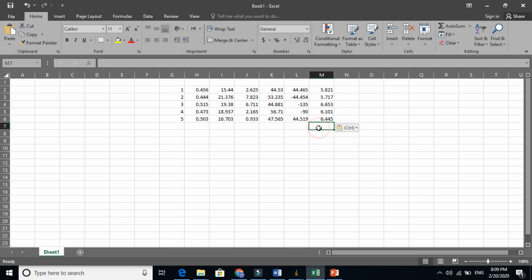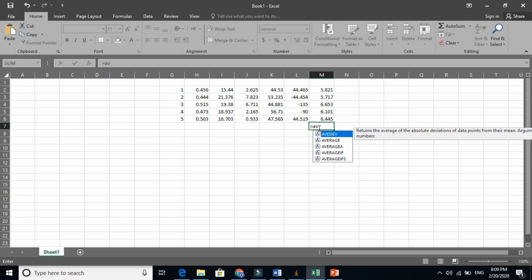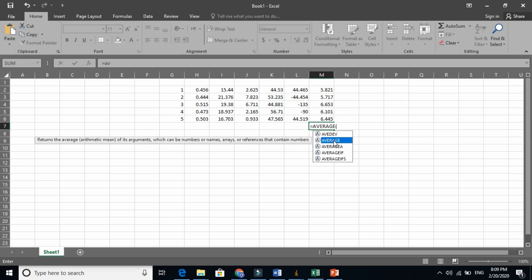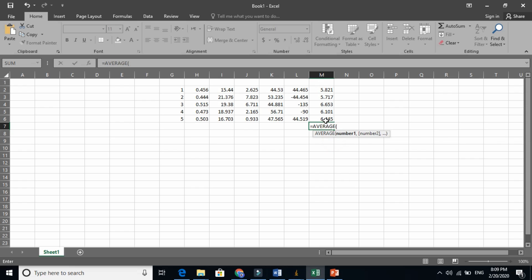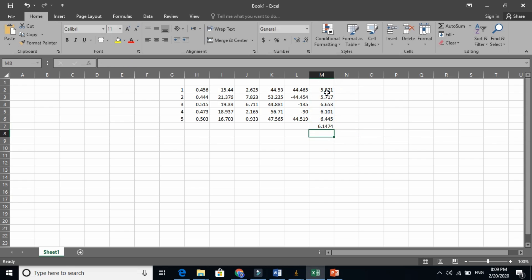And put it in the Excel here. And here write the average formula here. So it will give you the average grain size, very easily 6.1. So this is one way.